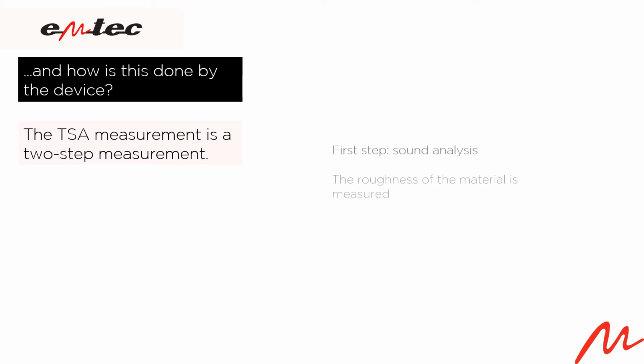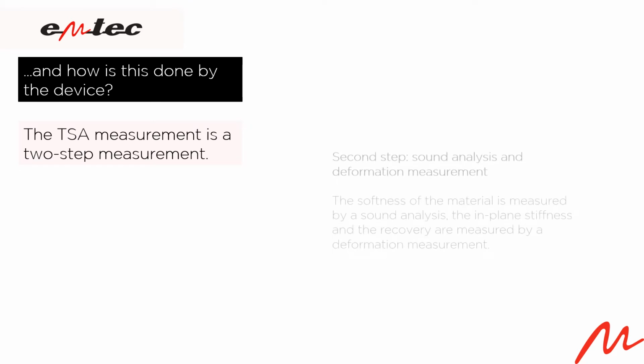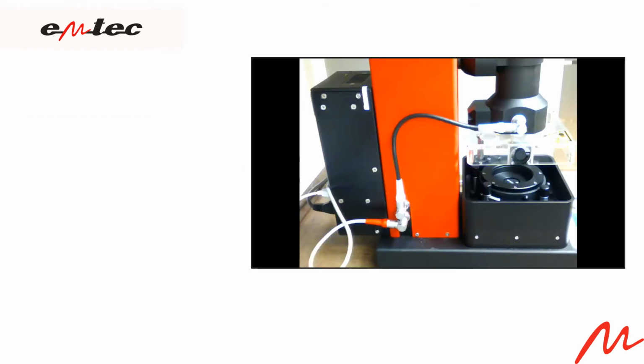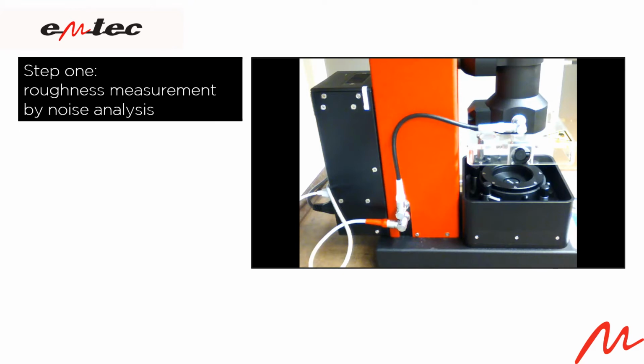The TSA measurement is a two-step measurement. The first step is a sound analysis. The second step is a sound analysis again, followed by a deformation measurement. In the first step, the roughness is measured by a noise analysis.